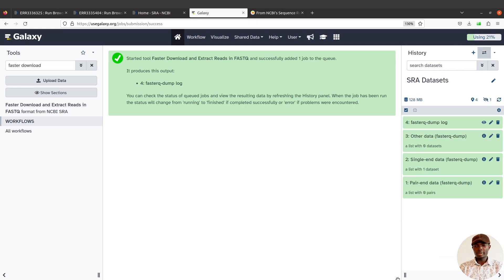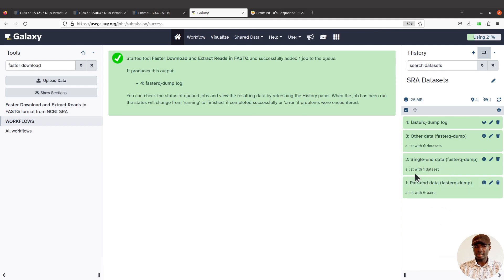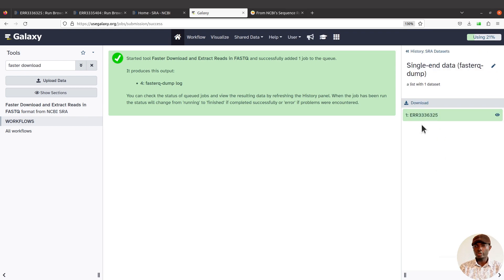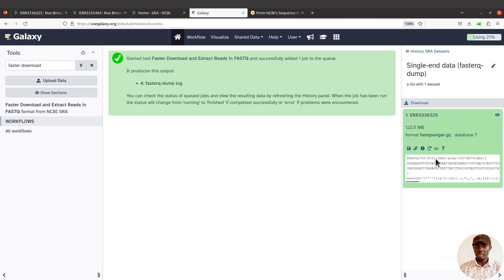The data has been imported. We have four outputs: paired-end data, single-end data, other data, and a FASTQ-dump log. The paired-end and single-end outputs are dataset collections. Dataset collections allow us to combine multiple datasets into a single entity and then do batch processing — it's a powerful tool for processing multiple files or samples. Let's look at the single-end collection: it says it contains one dataset. If you click it you can find the data and examine its properties, such as format and quality encoding.